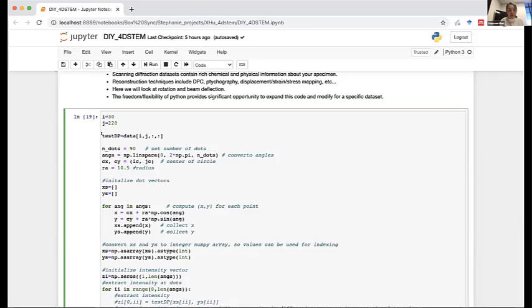The first thing I'm going to do is take one diffraction pattern and use it as my test. I set this flexible so I can change it. My advice is that as you're developing your own code and creating methods like this, leave this flexible and test your method on a lot of different pixels from different parts and different types of sample areas within your whole sample, because before you run on the full data set, you want to try to minimize error and erroneous information. What I'm going to do here is select my number of dots.